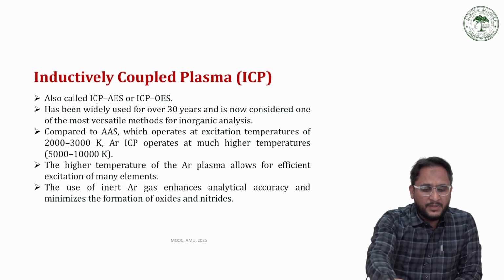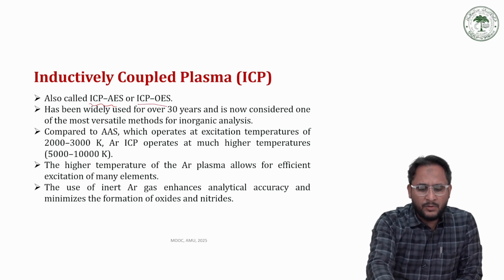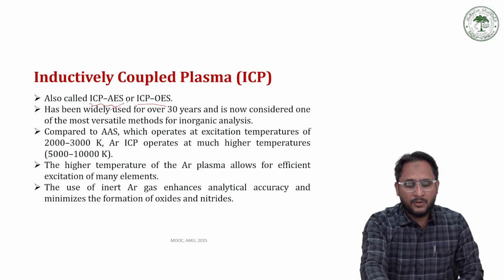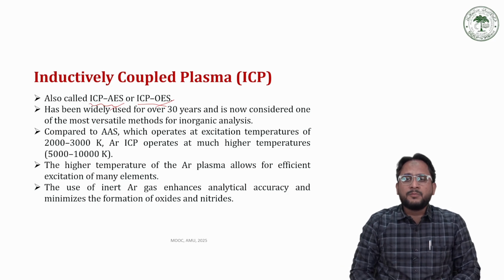This ICP is also known as ICP-AES or ICP-OES, which means inductively coupled plasma atomic emission spectroscopy or inductively coupled plasma optical emission spectroscopy. It is one of the widely used methods of the AES technique.